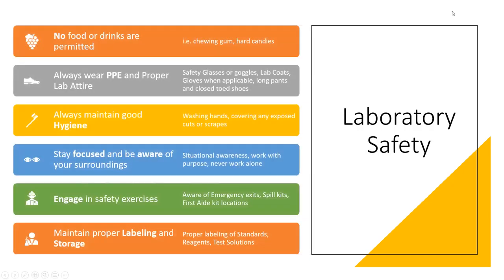So we will now take those principles and apply them to laboratory safety. So laboratory safety is very important to me, working in a laboratory. It's a hustle and bustle, so you always want to be aware of your surroundings and what is going on in a laboratory. So following laboratory safety limits the exposure to hazards and keeps you and your colleagues safe, which is top priority. We will focus on the more important practices to follow.